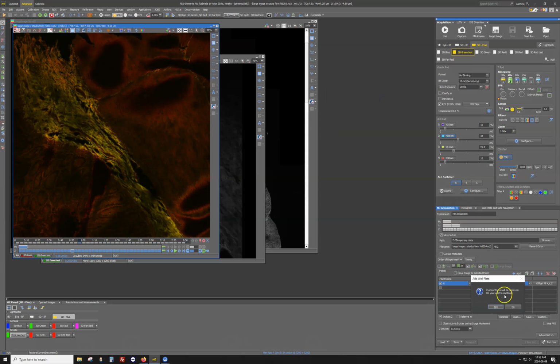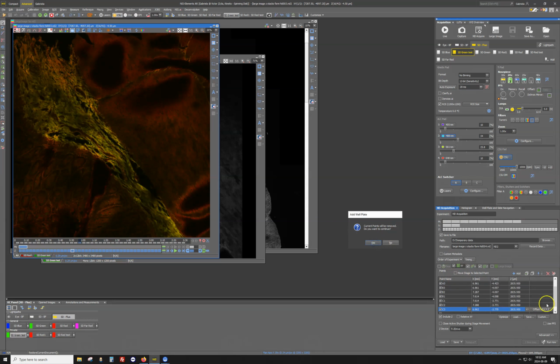When this button is pushed, another small window will pop up, which will warn you that whatever you had in the XY tab will be replaced by the new positions which were created, and that which will form your large image later on. So each tile now is considered as a position. All we have to do now is to push the Run Now button.